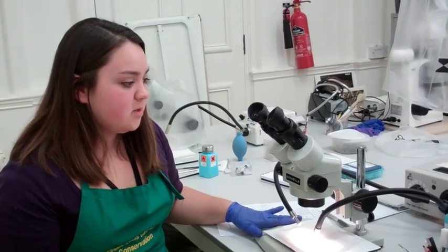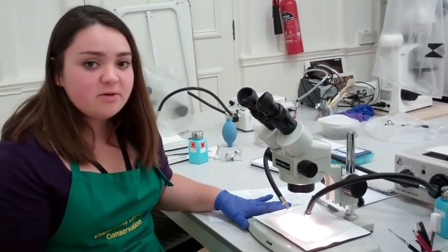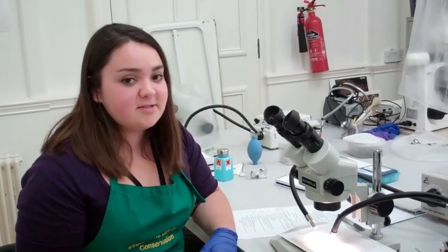These are the bench microscopes that we use every single day with every single object. Most of the hoard items are very small, so the fact that these go up to 45 times and have variable focus is fantastic.